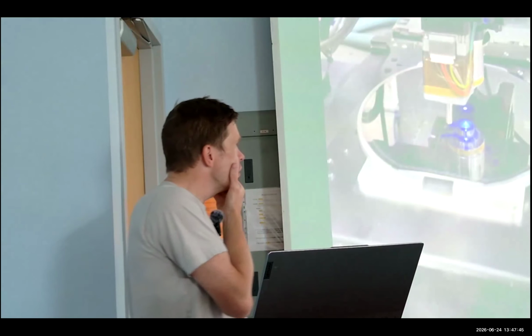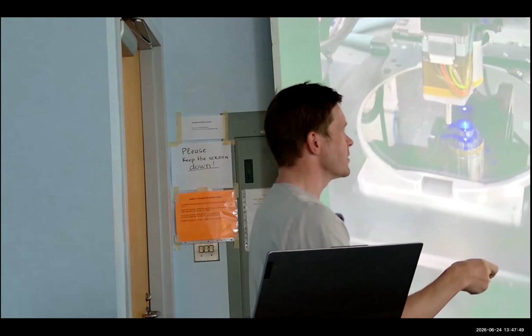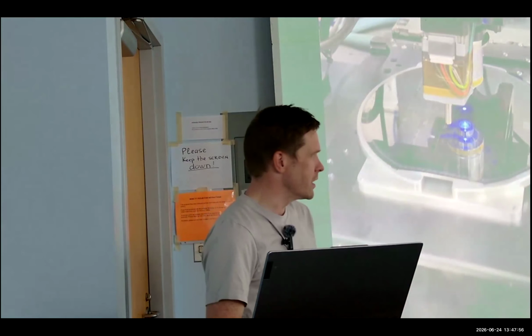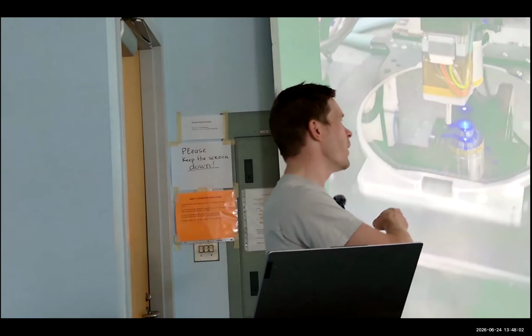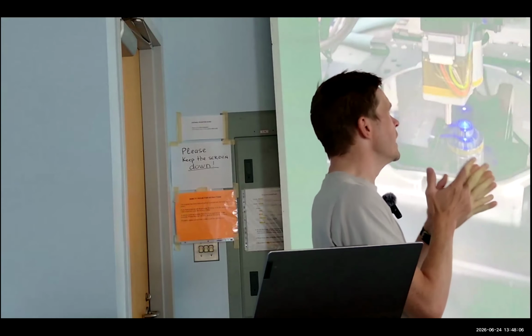One of the newer, cooler technologies really starting to come into the world of microscopy now is line scan. It's kind of blowing the minds of people who have been in the industry for quite a while, because of the speed you can operate these things at.